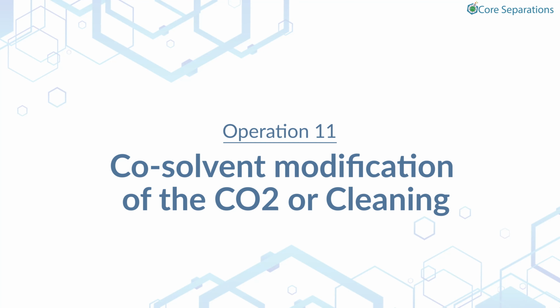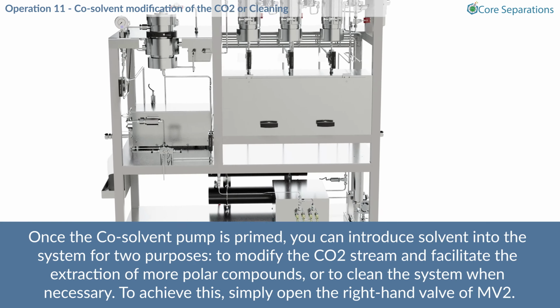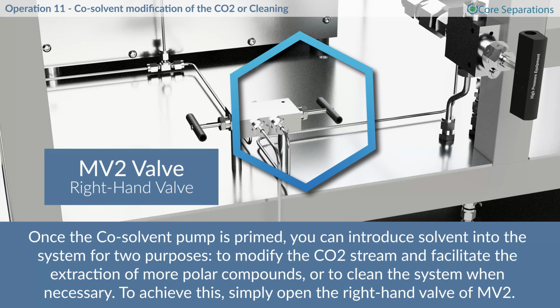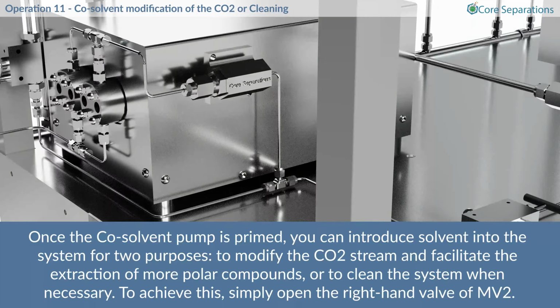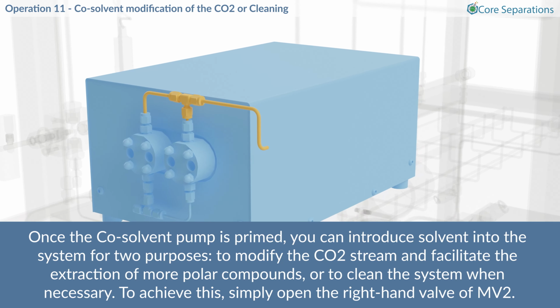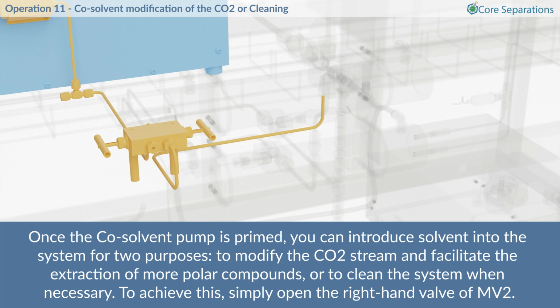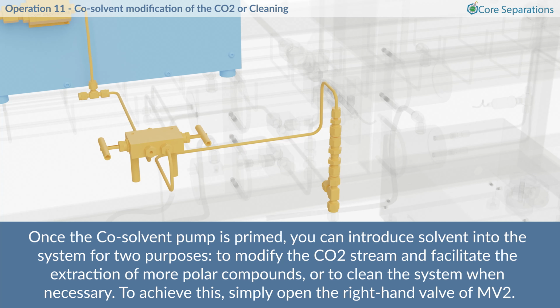Operation 11. Co-solvent modification of the CO2 or cleaning. Once the co-solvent pump is primed, you can introduce solvent into the system for two purposes: to modify the CO2 stream and facilitate the extraction of more polar compounds, or to clean the system when necessary. To achieve this, simply open the right-hand valve of MV2.